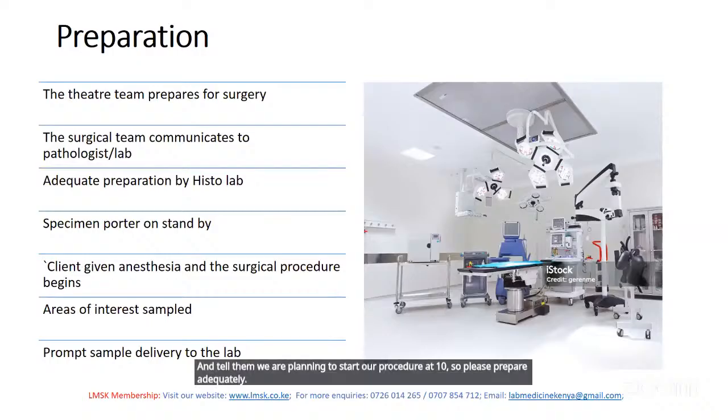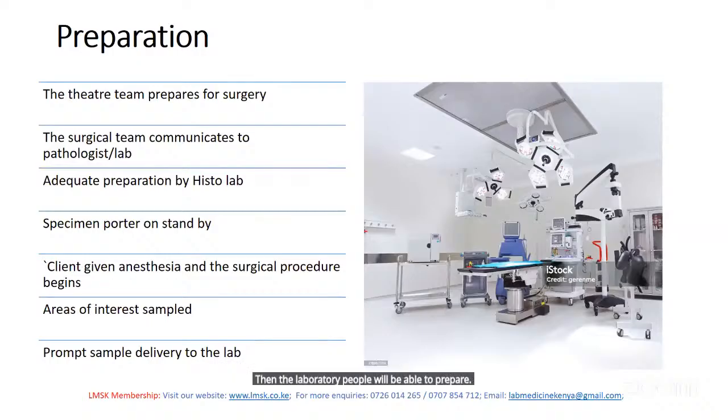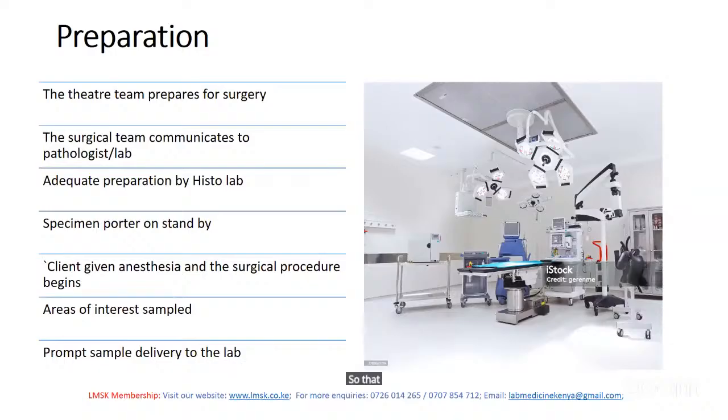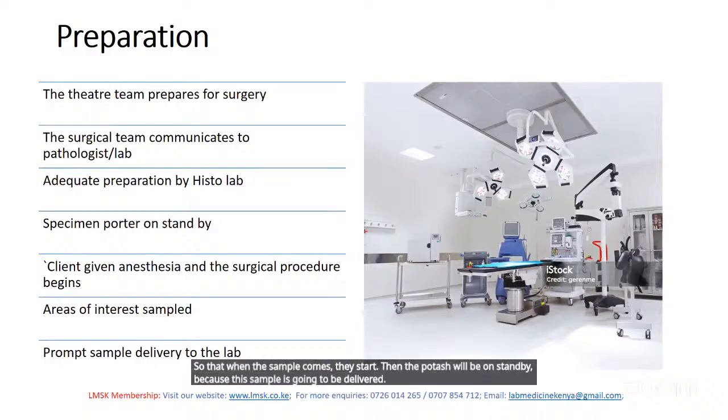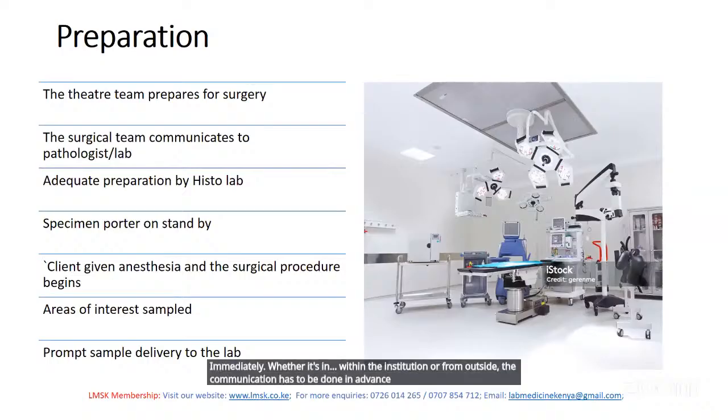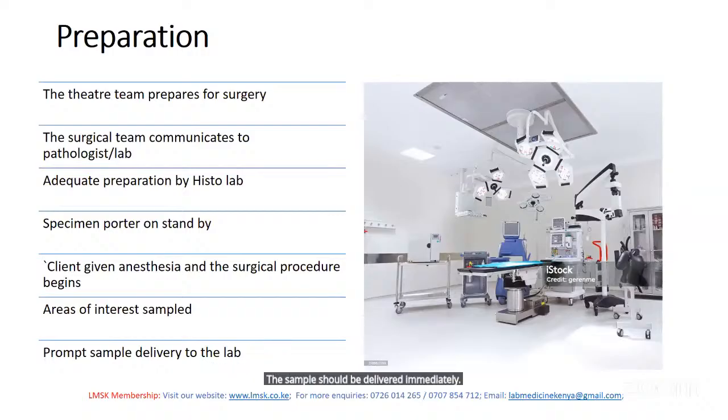Then the laboratory people will be able to prepare by switching on the machine, setting up the staining area, the fixatives required, making sure the OCT gel is in place, everything that they need, so that when the sample comes, they start. Then the porter should be on standby, because this sample is going to be delivered immediately, whether it's within the institution or from outside. If the communication has to be done in advance and the sample porter has to be on standby, the sample should be delivered immediately, preferably within 15 minutes.